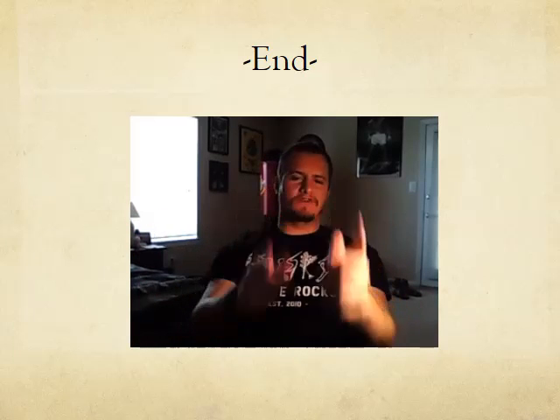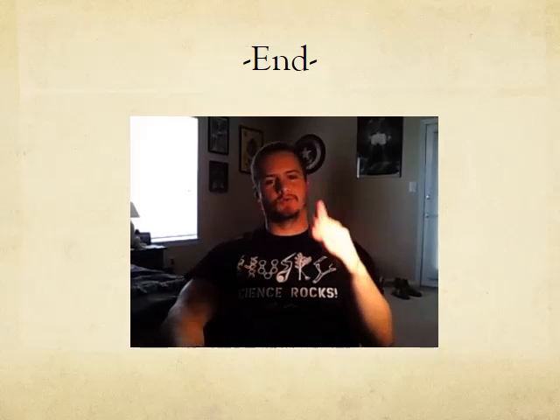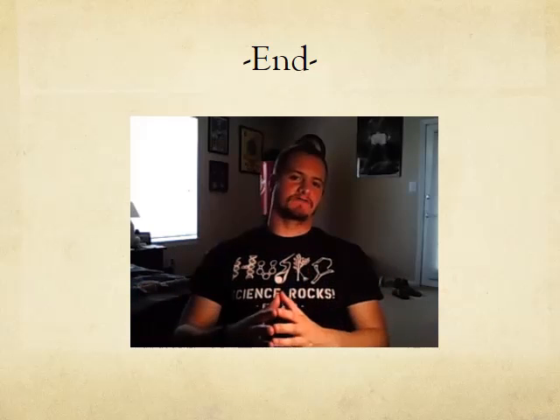So, a rather short video PowerPoint lesson today. Not really too much to it. We just talked about the parts of the microscope, what each one does, how to focus in on whatever it is you're looking at, and finally, how to calculate your magnification.